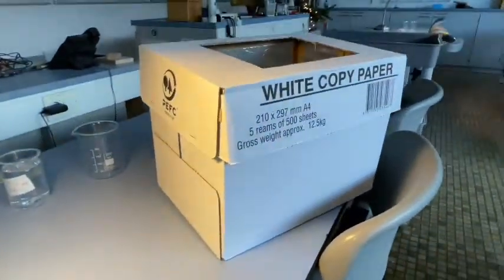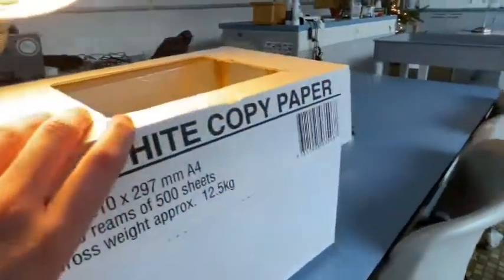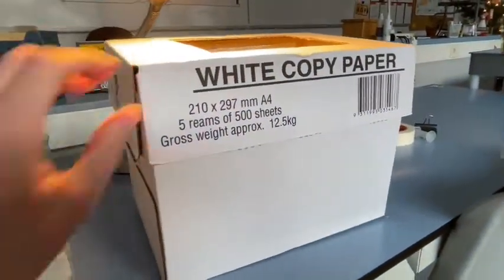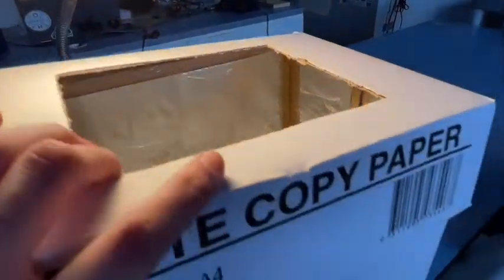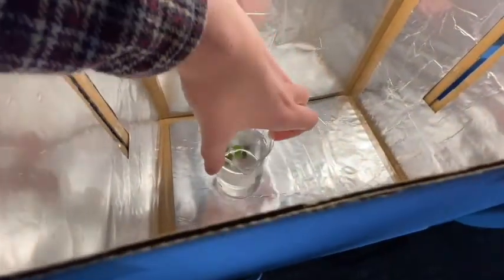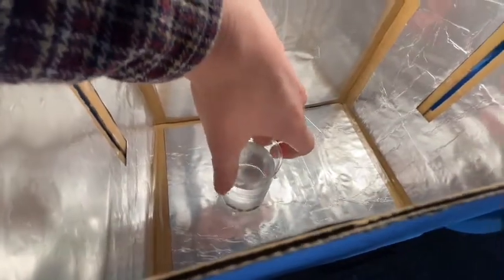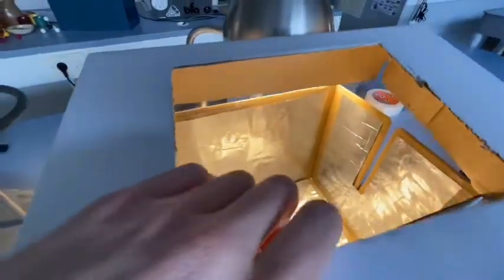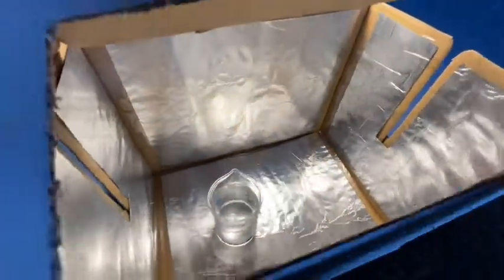What I'm going to do is place it inside of this photosynthesis light bath that I've created out of a copy paper box. I've cut a hole out of the top here, and I basically lined it with aluminum foil and put that inside of the box. When I put the lamp inside, it's going to reflect light all around, and this increases the lux, the light that the leaves can receive.